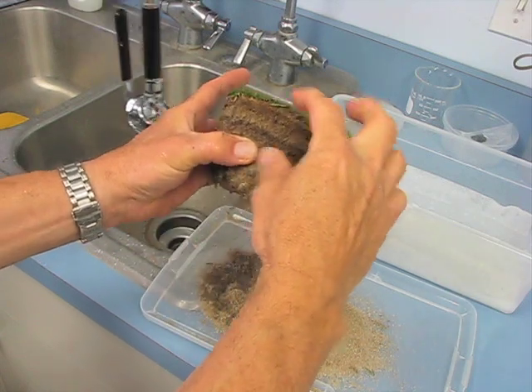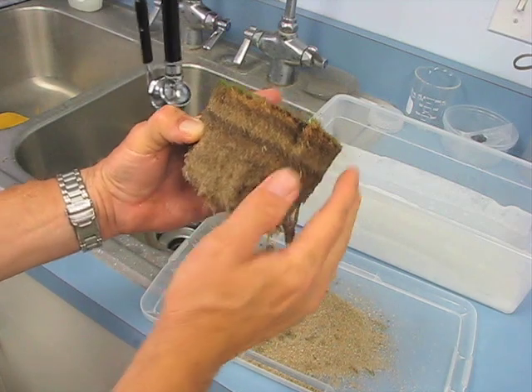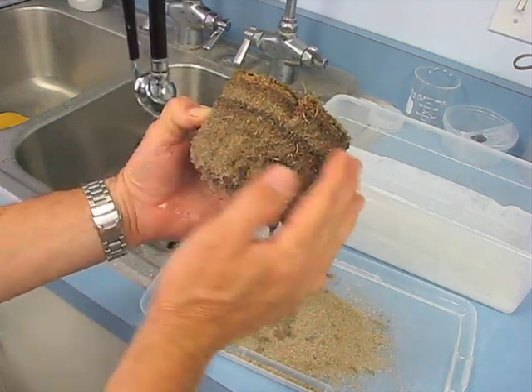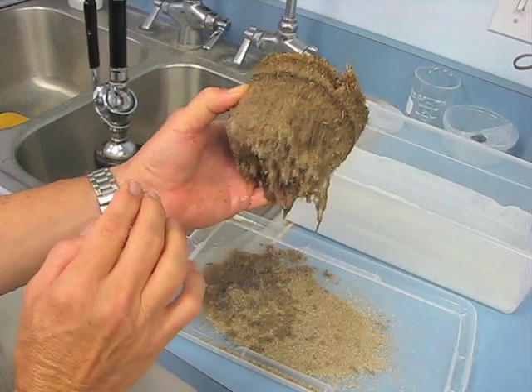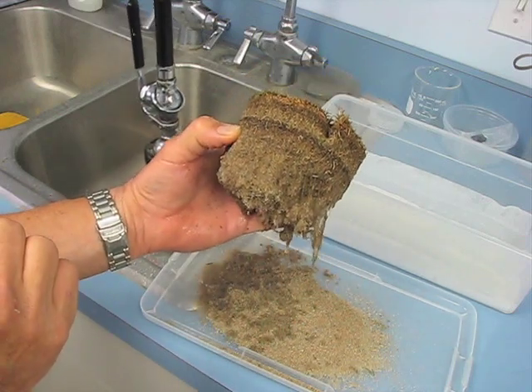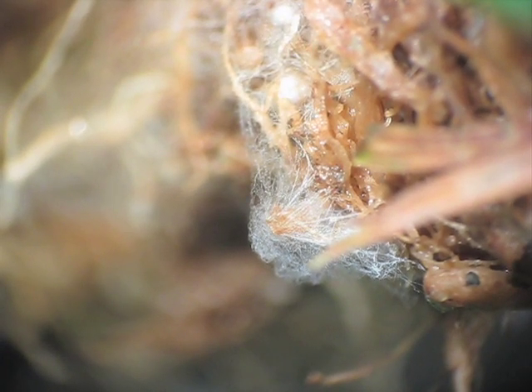You can also see at the top of the sample there's a little bit of degradation of the thatch in this area right here compared to the area adjacent to it. So then we'll wait another 24 to 48 hours and we'll check the surface of the plug to see if and where the mycelium might show up.